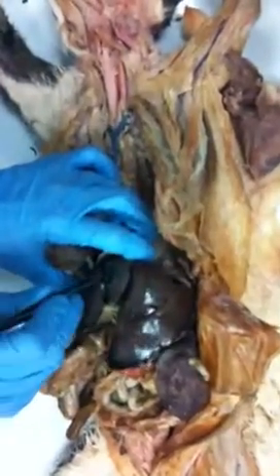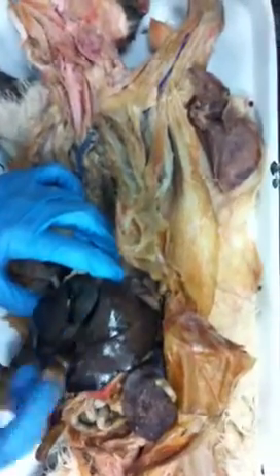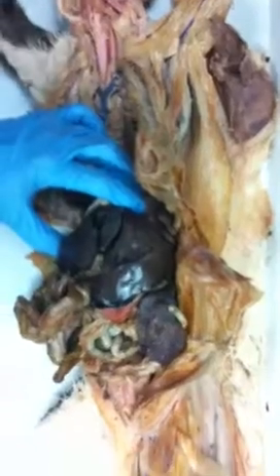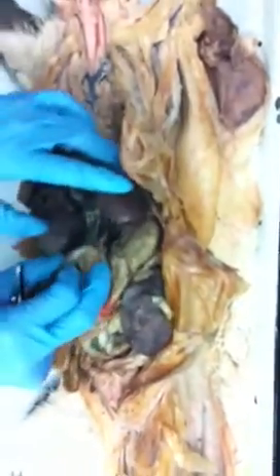This shriveled up green pea looking thing in here, that's the gallbladder. The liver produces bile. Bile is a collection of salts that acts as a fat emulsifier. It breaks up the big fat globules into tiny little droplets, which makes them much easier to digest. That bile has to be delivered right to the beginning of the duodenum as well.